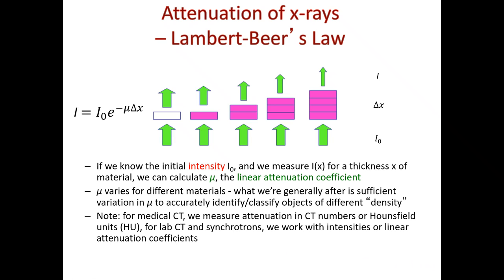The problem is actually, did you physically tailor your sample, and whatever contrast you're trying to measure in the sample, to your X-ray energy, really? Okay. Otherwise, no change of numbers can really help you.